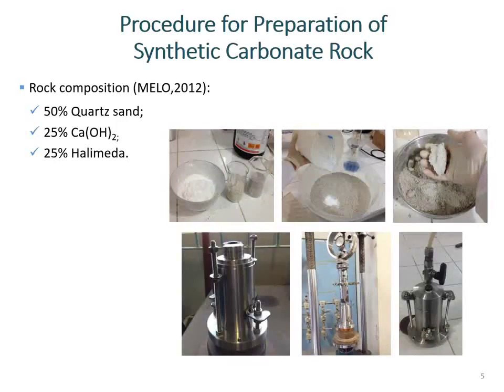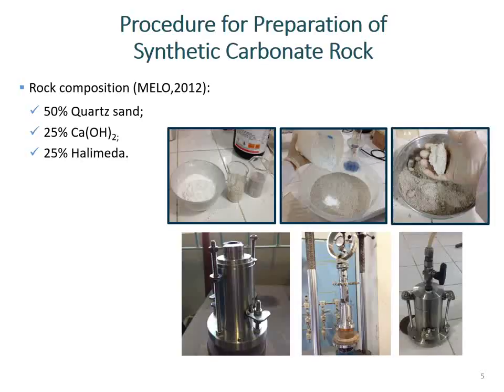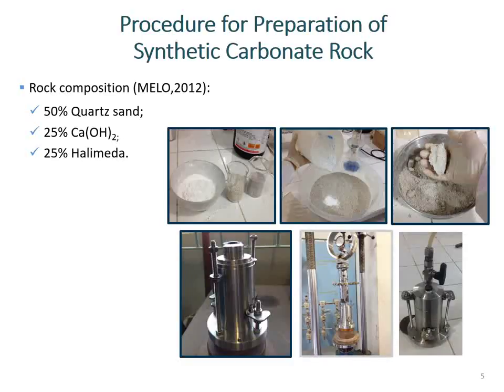The dry materials were weighed in the same analytical balance, mixed and homogenized by hand with distilled water for about 5 minutes until a homogeneous mass was formed. Subsequently, the material was deposited in a compaction cell where static compaction was performed. The target value for height of the compacted sample was 8 cm.